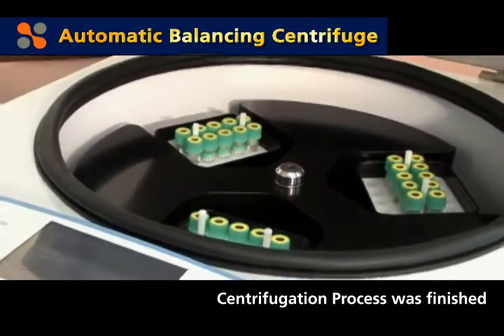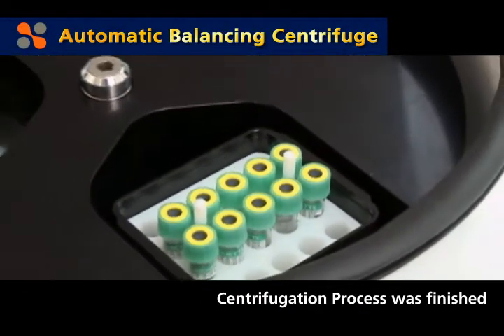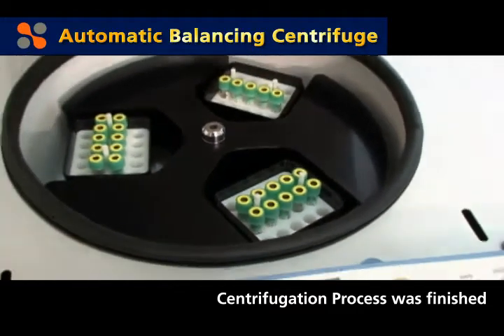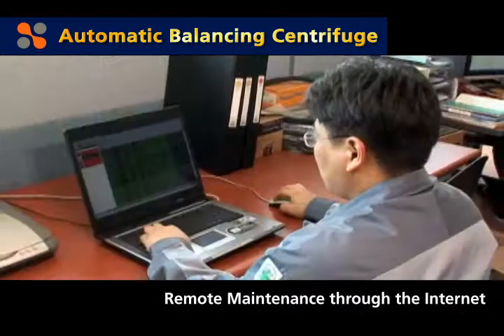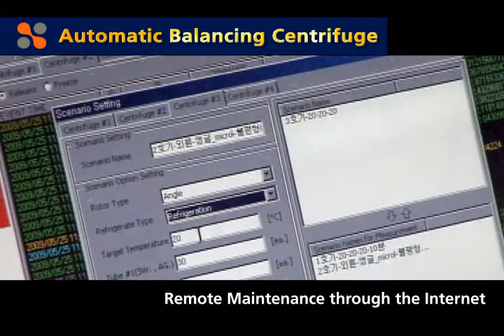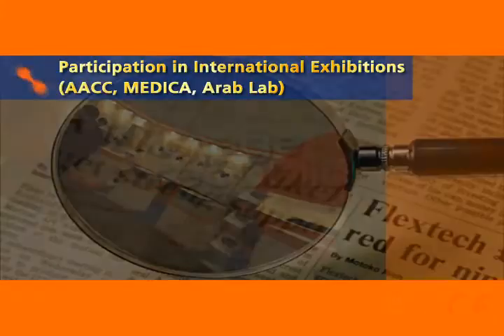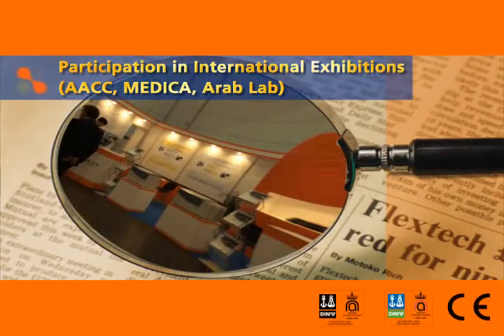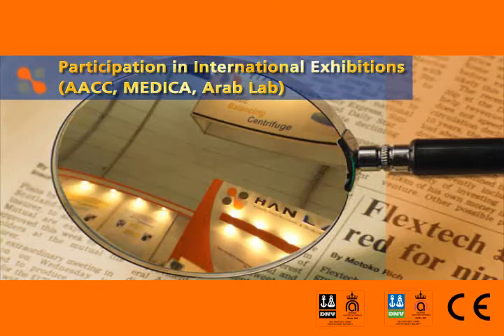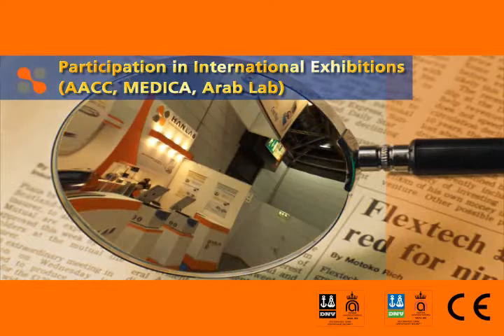In addition, when connecting the product installed on the user's site to the internet, this product provides users with a remote monitoring service that can promptly help users solve problems by automatically monitoring the operation state of the product from a remote site. The quality and technology of HanLab's automatic balancing centrifuge are widely recognized through the acquisition of many patents and certificates.